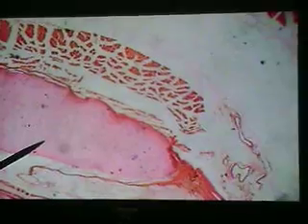Okay. So, we're seeing two cavities here. There are two cavities here. This large structure here. So, first of all, we're seeing juxtaposition of certain things. Suppose we went into the exam and, using a student microscope, I can bridge from this point, look here, bridge from here, right over to here. So our student microscope could do that. I could just bridge these two points very well.